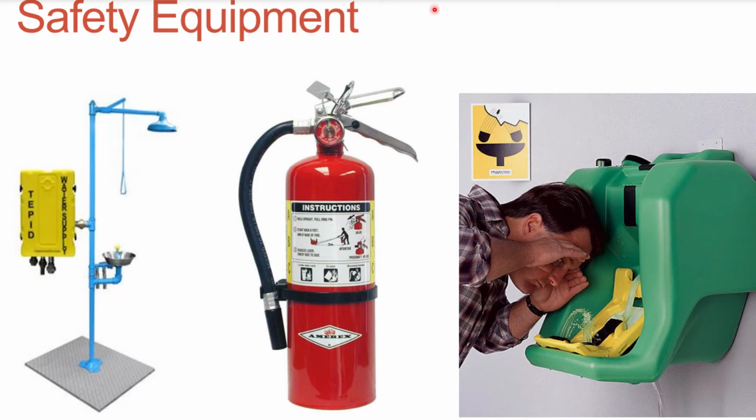These are the different safety equipment that I have mentioned earlier, and this has been developed specifically for use in the clinical laboratory. The employers, class, are required by law to have designated safety equipment available, but it is also the responsibility of the employee to comply with all safety rules and to use safety equipment. All laboratories are required to have safety showers, eye wash stations, and fire extinguishers, and to periodically test and inspect that equipment.